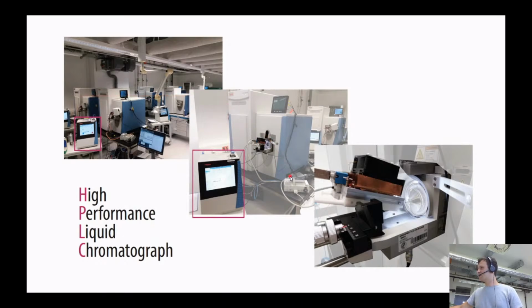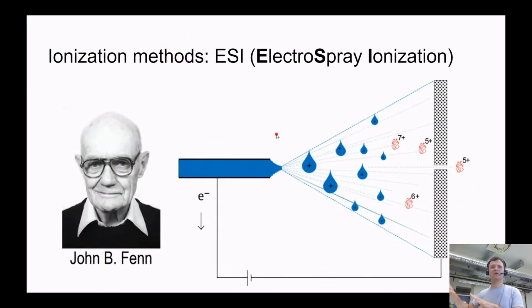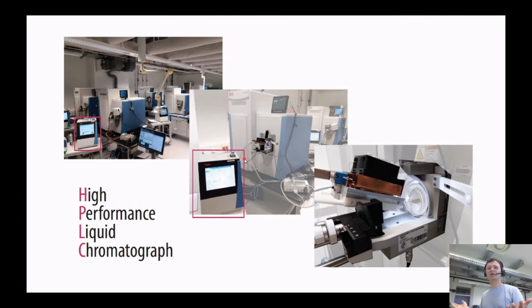The main point here is that we're trying to avoid a situation where all 10,000 proteins go out of the tube simultaneously. How do we do this? We separate all these proteins through time and by some physical chemical property. So it's basically divide and conquer, if we speak in computer science terms. By that, in 1 second, we can analyze not the whole 10,000 proteins, the whole proteome, but a subset of this proteome. Let's say not 10 proteins, it's usually something like 200 proteins. Cool.